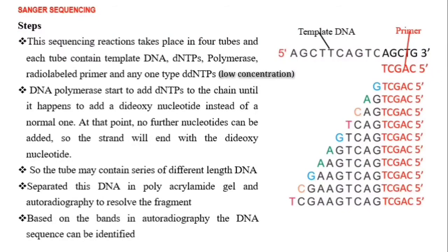Based on the bands in the autoradiography we can construct the sequence.